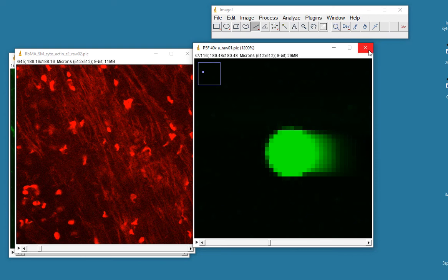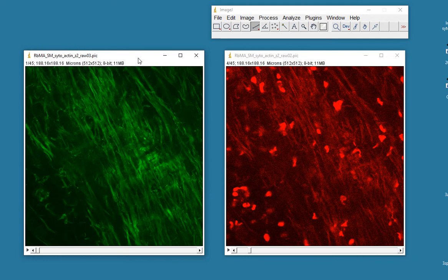Okay, I happen to know that in this microscope, let's say, my spherical aberration is about 3 microns, quite long, 3,000 nanometers.